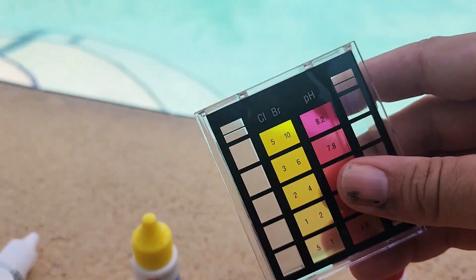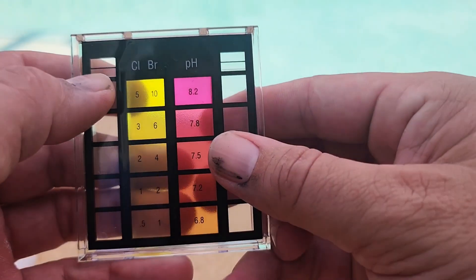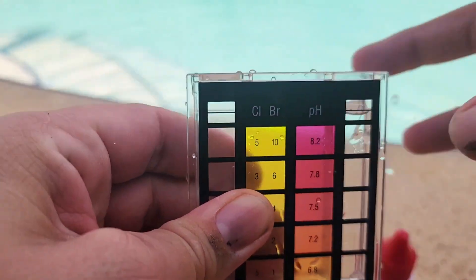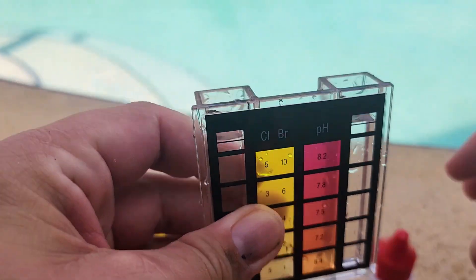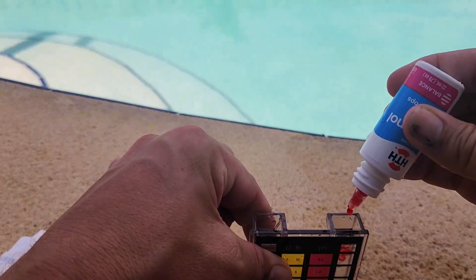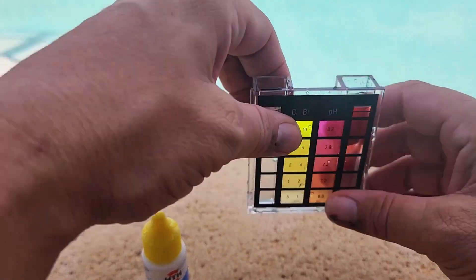To use this kit, pop the top off, fill it with water up to the lines, and what I do is fill it all the way up and stick my finger in to push it down to those lines on each side. Then take the red solution and do 5 drops on the right side, and that'll get it looking like this.